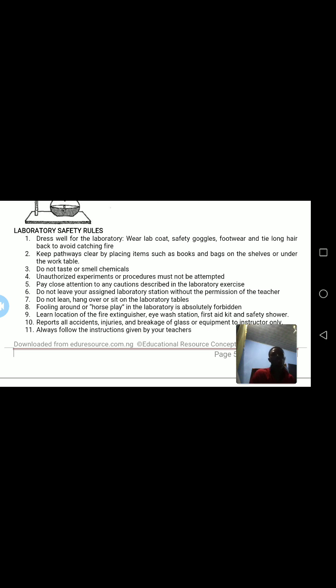For instance, acid is very dangerous. Sharp objects such as scissors and razor blades, and certain chemicals are not good. Chemicals like tetraoxosulfate acid and hydrocarbons, most of those found in the lab, are not safe.